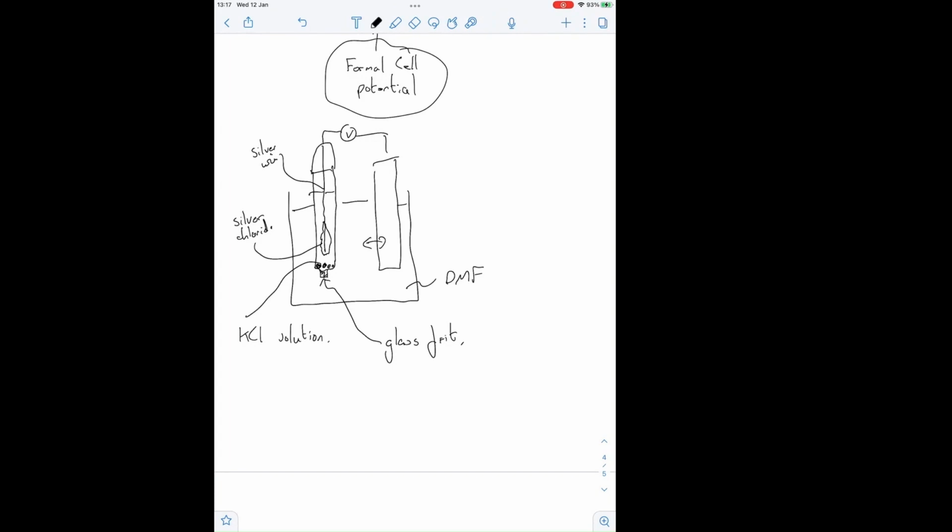If you're working at high pH, actually a silver chloride electrode doesn't work well at high pH. So if you're at pH 13, use a mercury oxide reference electrode. They're far more reliable at high pH. Clean your reference electrodes. The glass frit problem here, you often get salting in the glass frit.